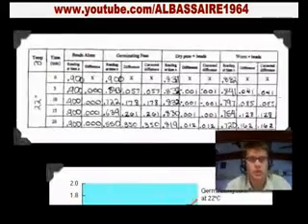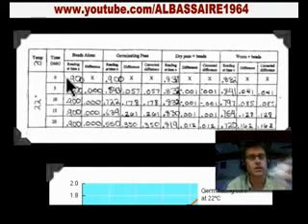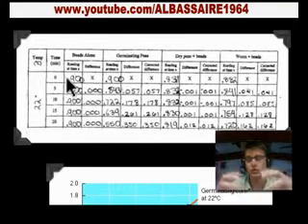If we look at some analysis for just a second, the analysis on this gets a little messy. First of all, you'll have beads in one of the respirometers by themselves, and the function of that is to just control for changes in the temperature. So there's going to be fluctuations within that water during that period of time, and so we'll actually subtract that from our values to find the difference, and that's going to tell us how much of the change in the volume is actually due to respiration.